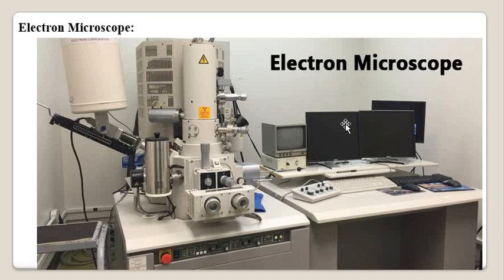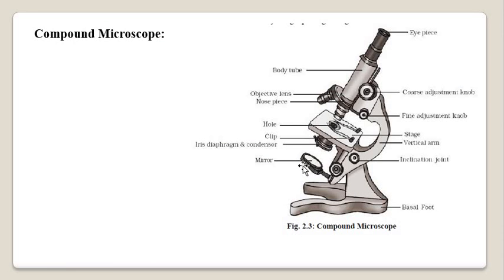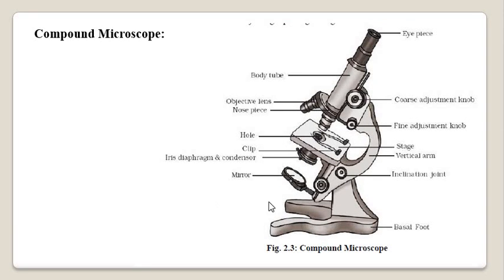The electron beam passes through the condenser coil and then falls on the object. It is like how, in the light microscope, light is carried through the diaphragm and condenser and falls on the object, and the magnified image of the object is observed by the eye of the observer through the magnification lenses.